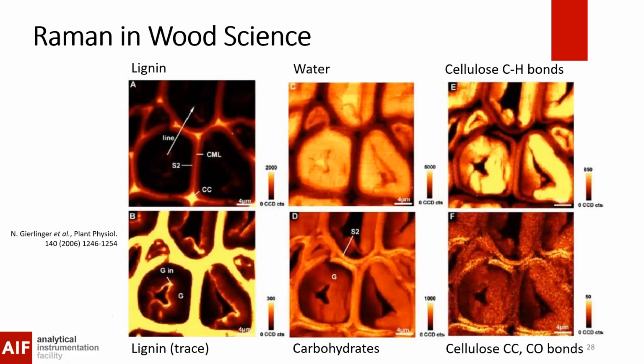So this is an example of where Raman worked in wood science.